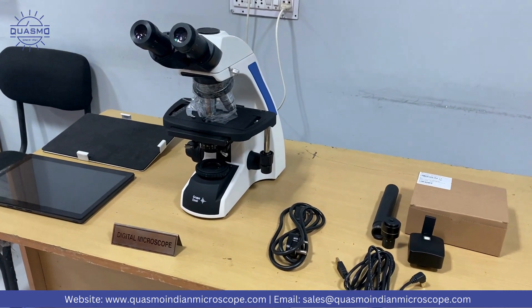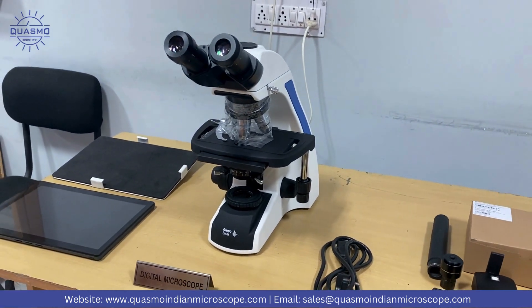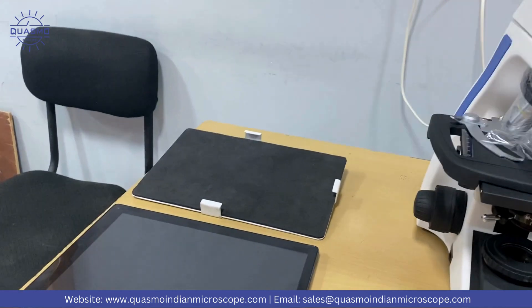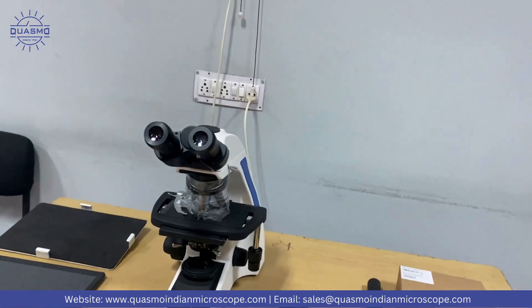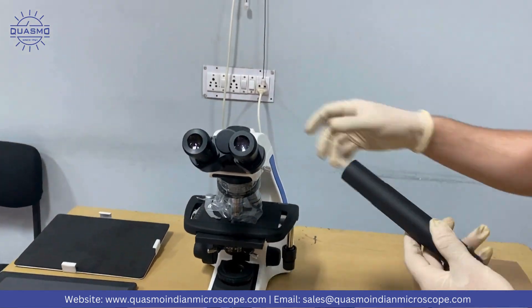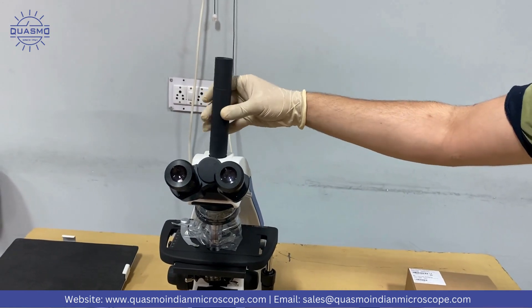This will be the installation video for the Digi Elite model. I will show you how we can attach this tablet PC right above here. Let's get started. First of all, take this and fix this here.